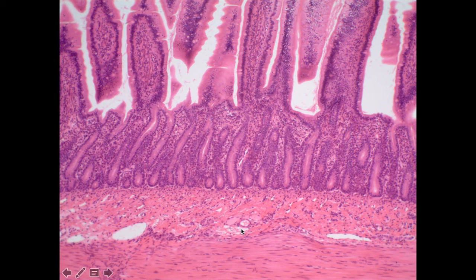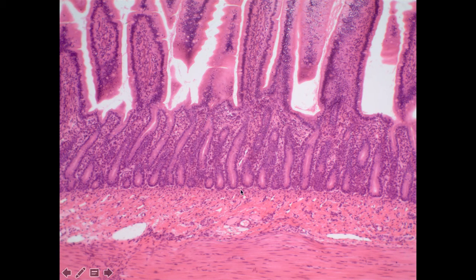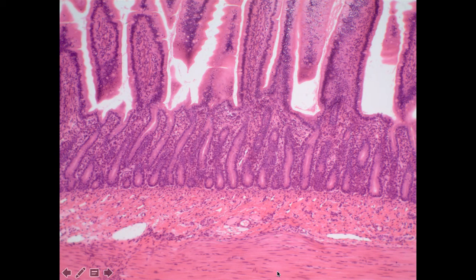The next region is the jejunum, which really doesn't have any defining feature. Here we can see the very nice prominent finger-like projections — the villi — all the way down to the muscularis mucosae, then the submucosa. We don't see any glands, so the Brunner's glands are not here, which tells us this is not the duodenum. Then we can start to see the smooth muscle layers making up the tunica muscularis, with the first layer being the circular layer.